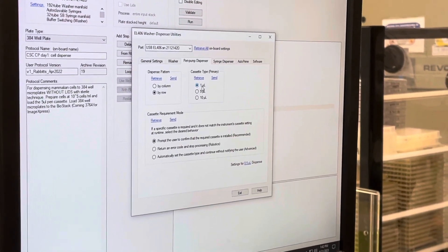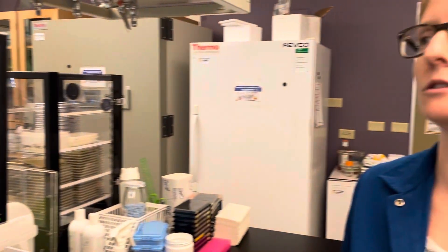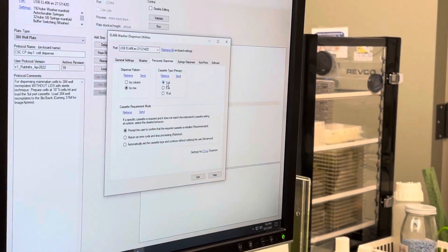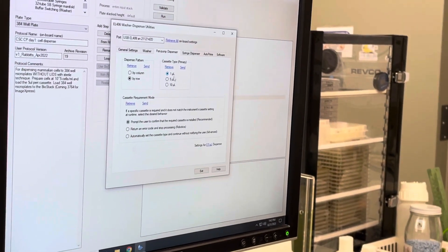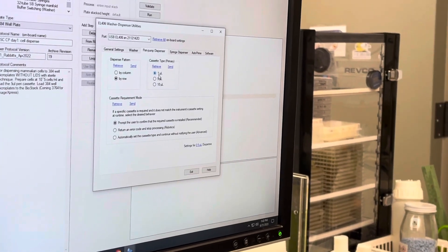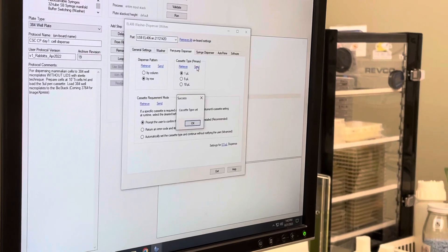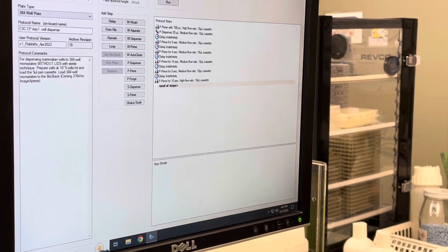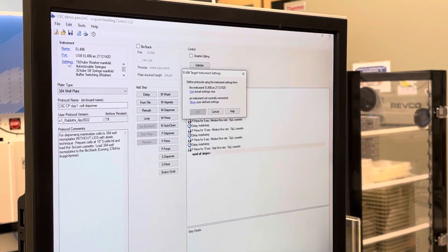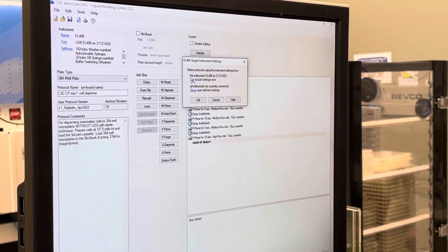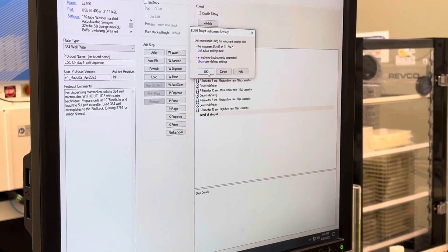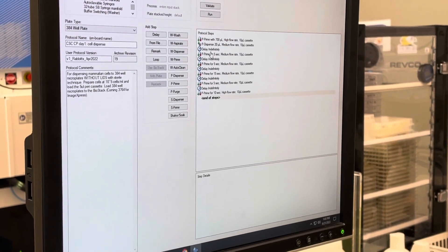We're going to use a one microliter cassette for this because the 1536 well plate has a two to three or four microliter assay volume. To dispense that most accurately, you use a one microliter cassette. Each revolution of the pump is going to be one increment, so for three microliters it'll just rotate three times. You click on the one and then say Send. It'll say Cassette Type Set. Then you exit and click on Settings and say Get. Those two steps allow the device and the current protocol to get the information.